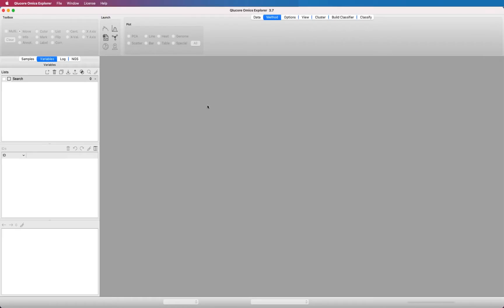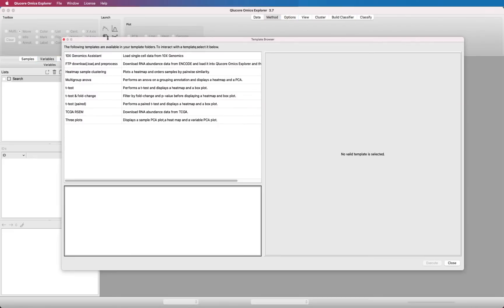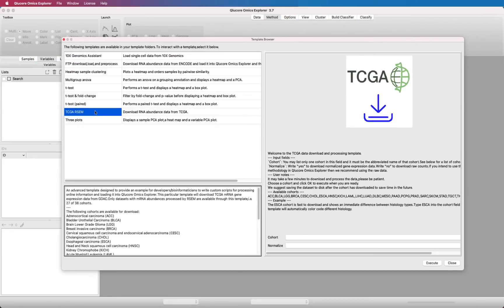Open the template browser and select the TCGA template. This template will download TCGA mRNA gene expression data from GDAC. Only datasets with mRNA abundances processed by RSEM are available through this template.